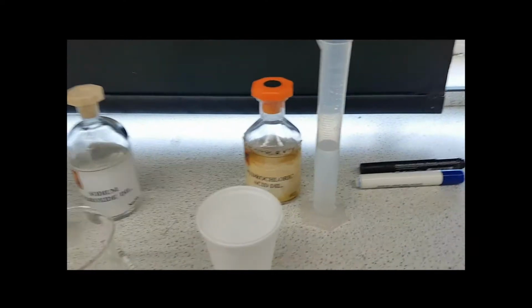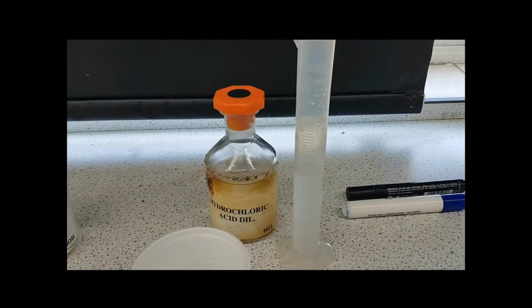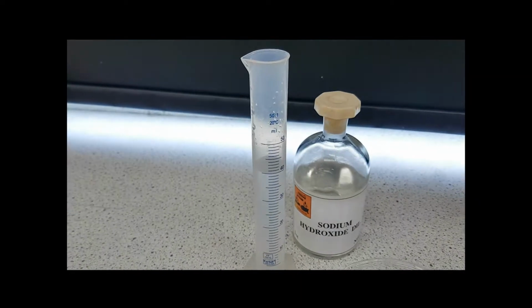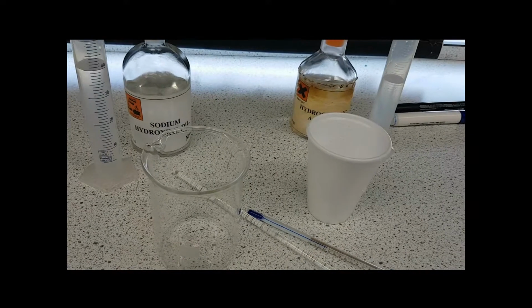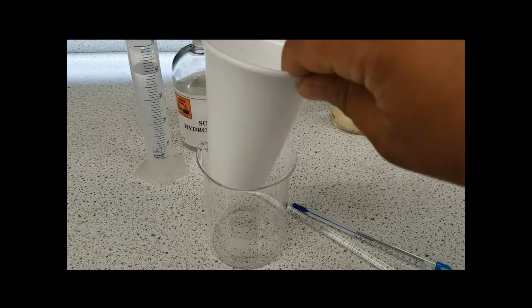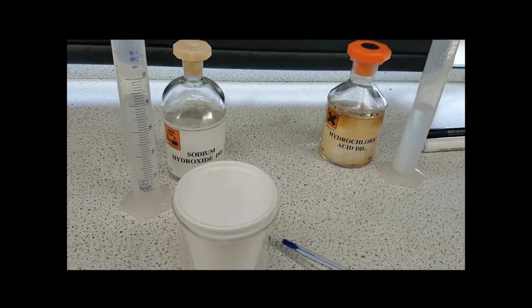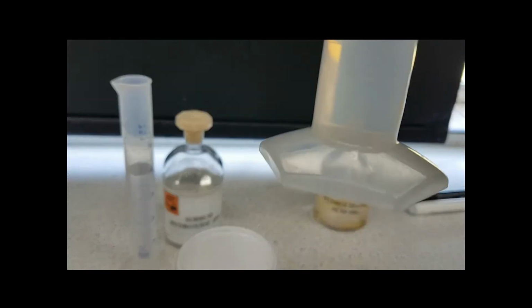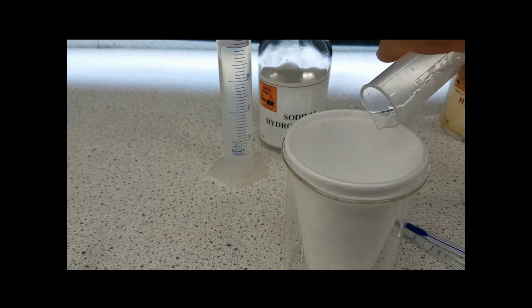So what we're going to do, guys, is measure out 30 milliliters of hydrochloric acid in our measuring cylinder, which I've already done. And we're going to do 40 milliliters of sodium hydroxide. The most difficult part of this experiment is you take this polystyrene cup and you put it in the beaker. Very difficult indeed. Once you've done that, you take your hydrochloric acid that you've measured out, I measured it to 30 milliliters, and you pour it into the polystyrene cup, like so.